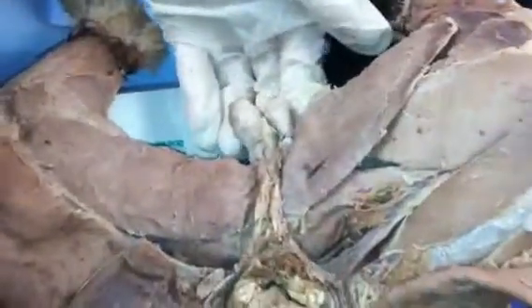These two. The thyroid cartilage, isn't it the butterfly? Yeah. The butterfly shaped one right here? Yeah. Wait, your hand's in the way. Sorry. The thyroid gland. The thyroid gland, we don't have it. And then the thymus gland, which we don't have, I think, either. The trachea is right here. This part right here.